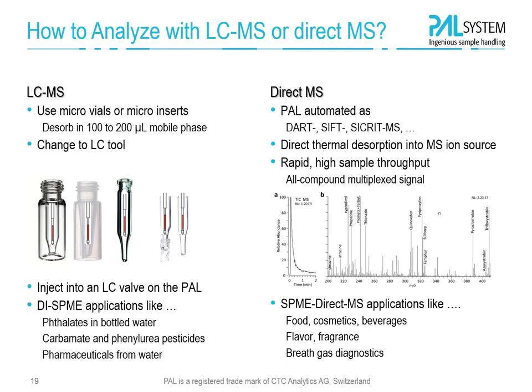Recently, also direct MS analysis using accurate mass or MS/MS for targeted analysis are in use. This allows a high sample throughput as the time-consuming chromatography is avoided.